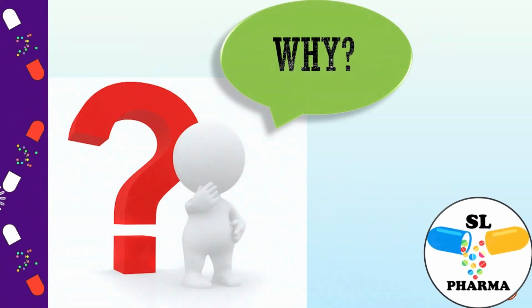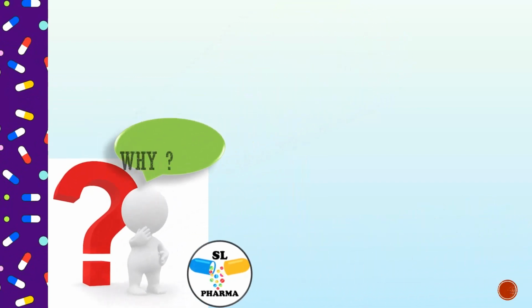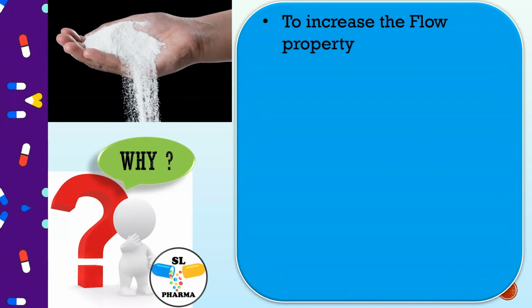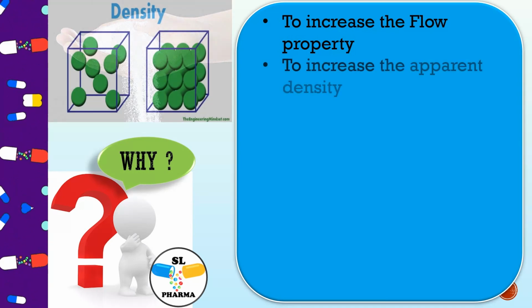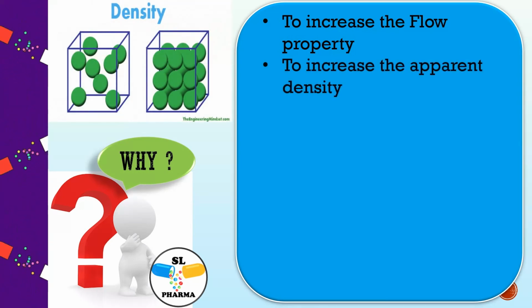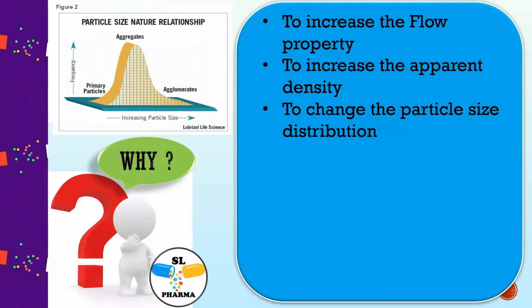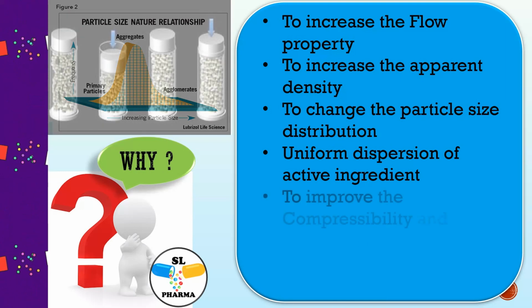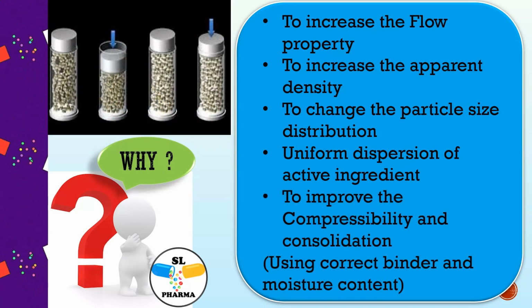Then we will see what are the reasons for the granulation process. Granulation is carried out for various reasons, such as to increase the flow property, to increase the apparent density, to change the particle size distribution, uniform dispersion of active ingredient, and to improve the compressibility and consolidation.